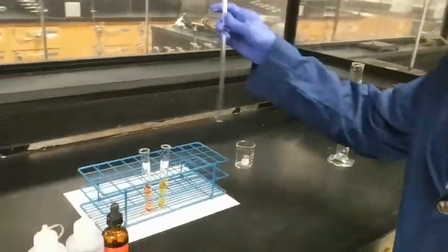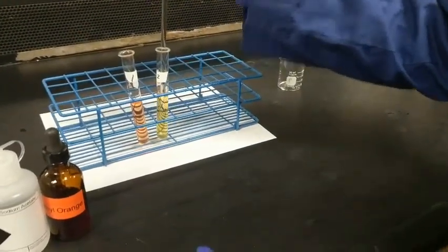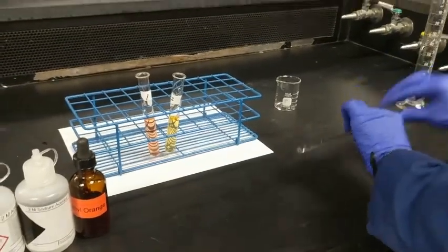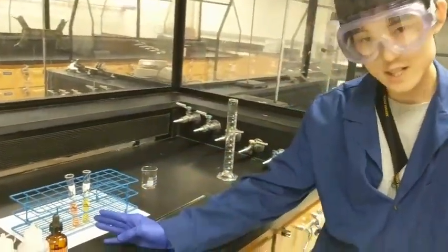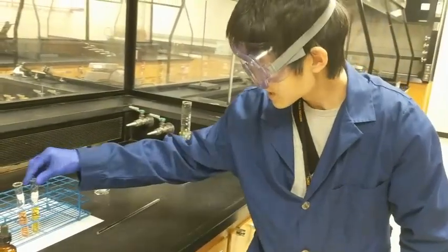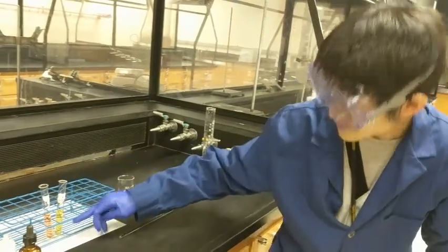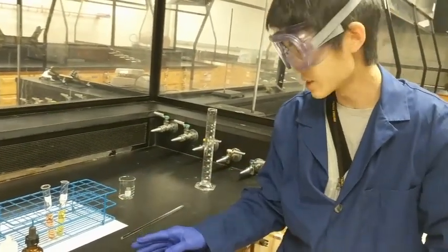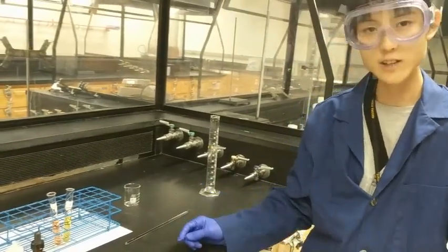And then we are going to gently mix it together. Now, compared to the reference, you can see the color of the solution is more yellowish after adding the sodium acetate solution. So based on this observation, please predict the direction of the shift in the equilibrium.